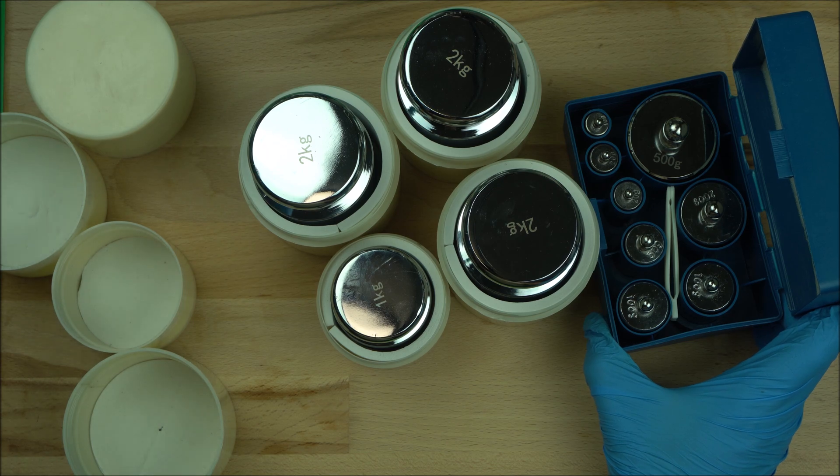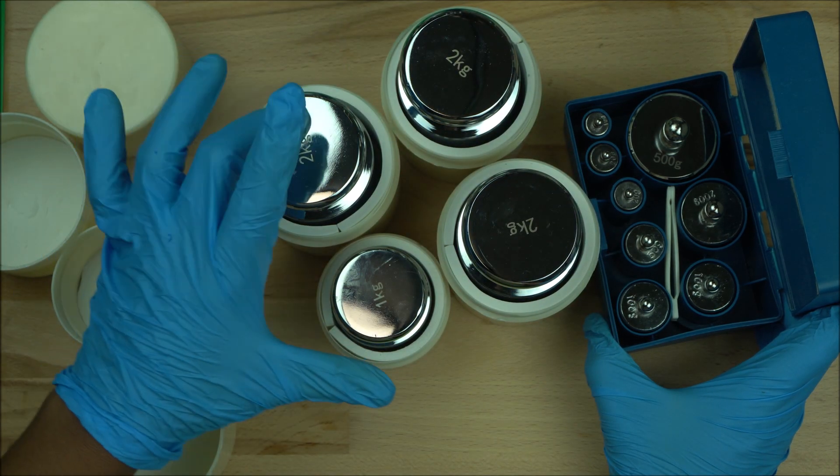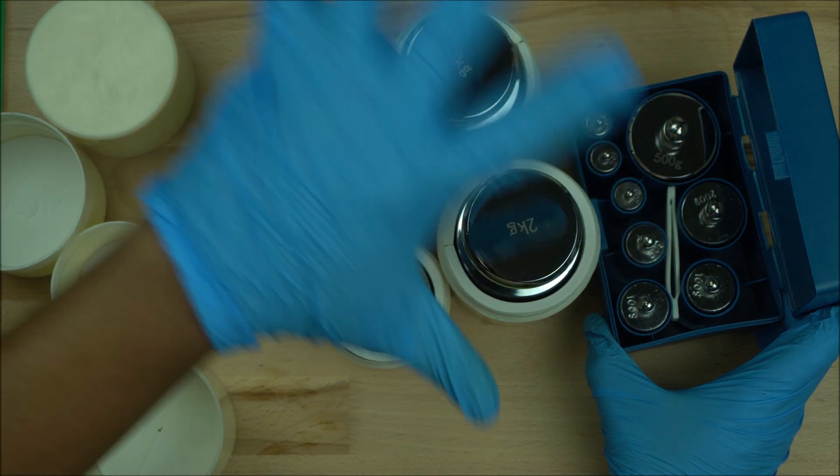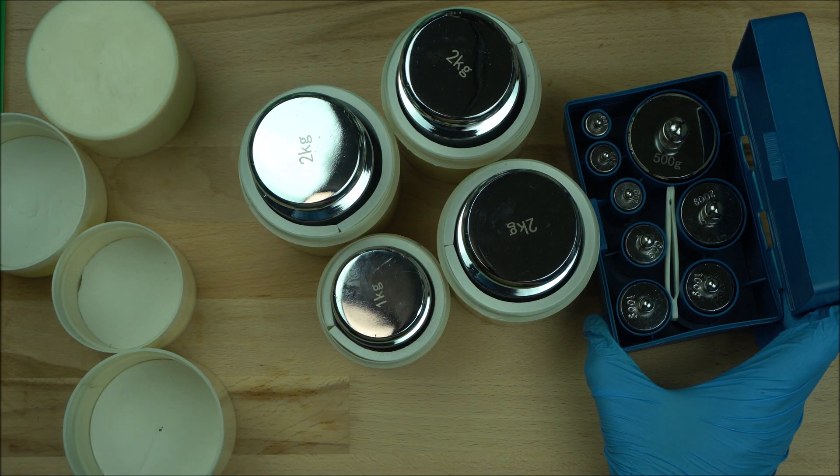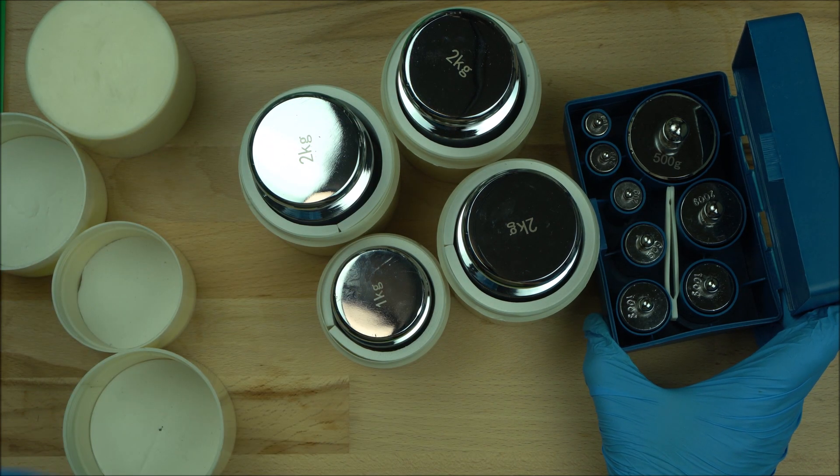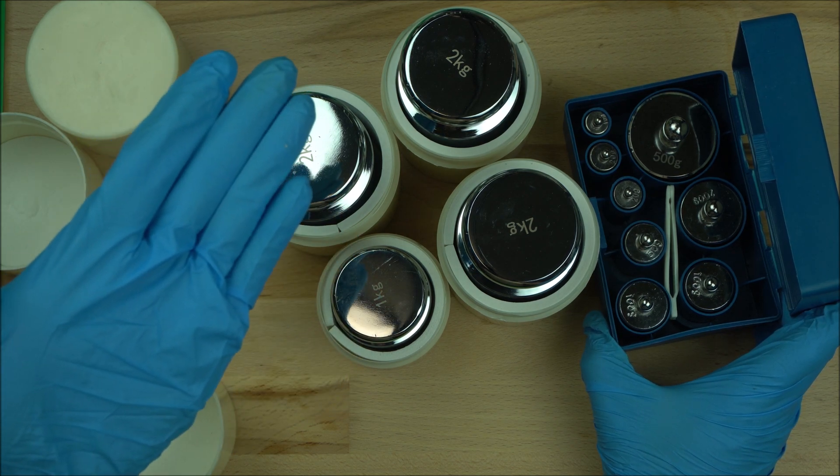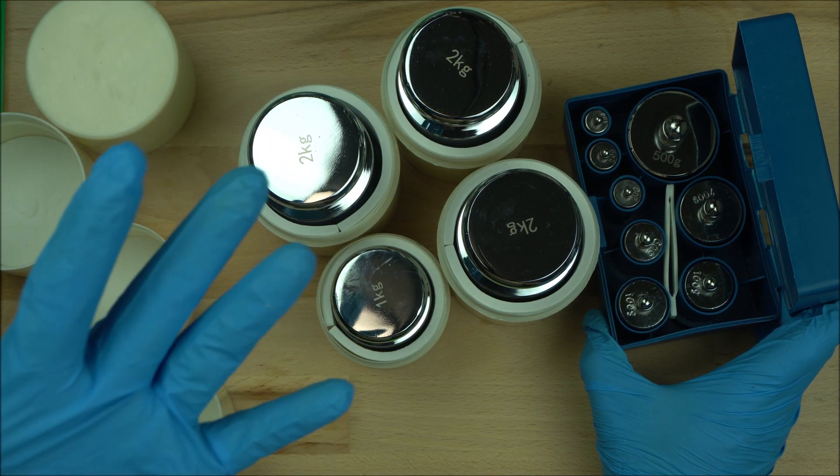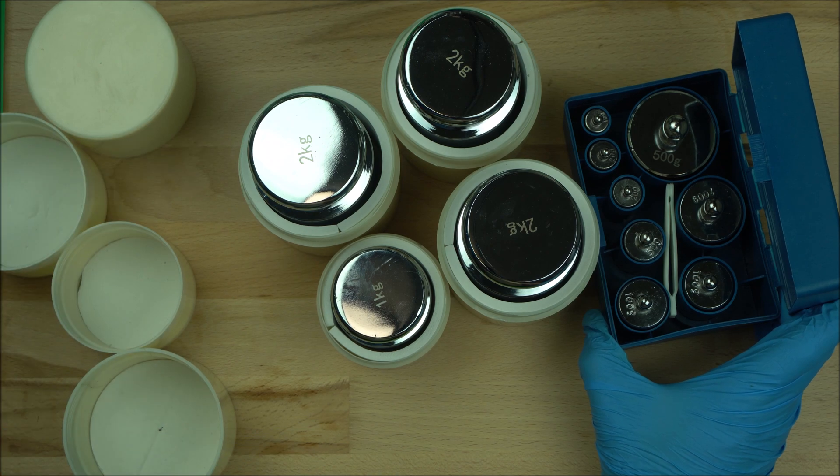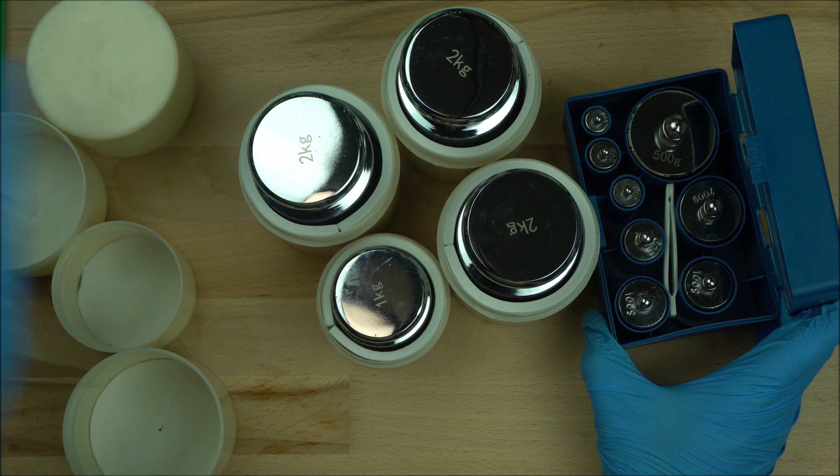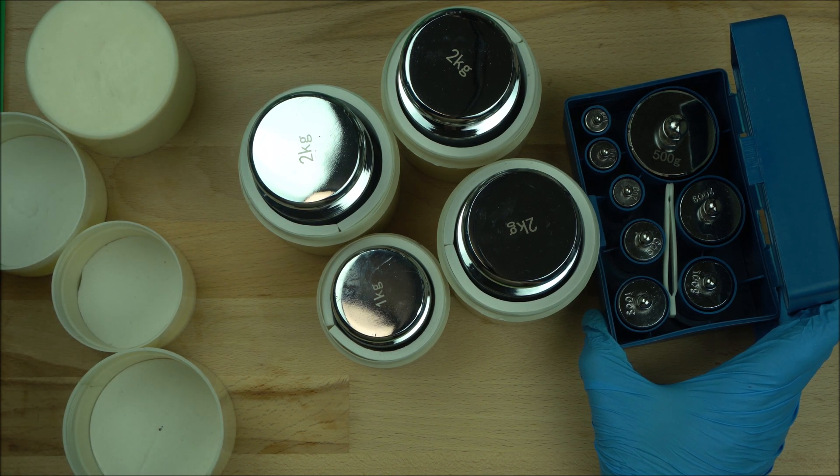If you have a bigger lab scale, like Ohaus and other ones, you can go for the smaller sizes. By the time you compile everything together, you're going to get the amount of calibration scale that you need to calibrate your scale—calibration weight I mean—to calibrate your scale.